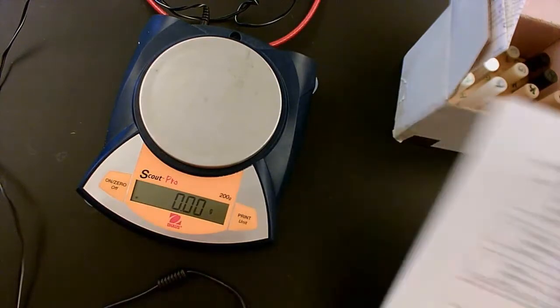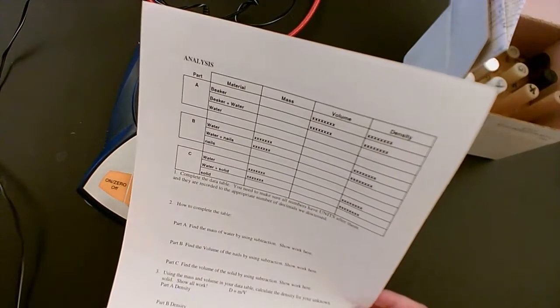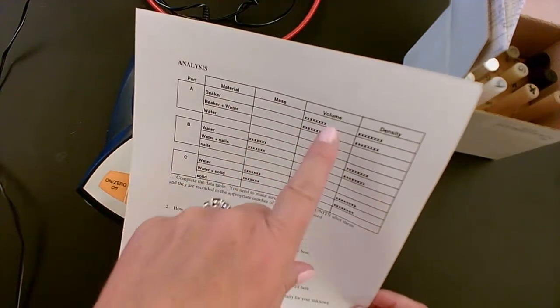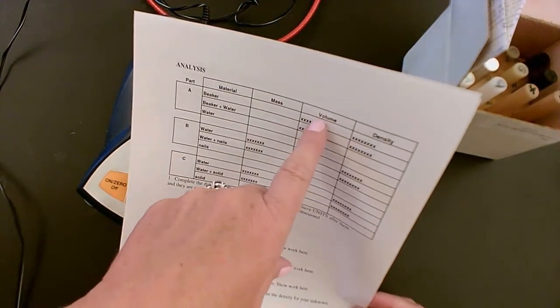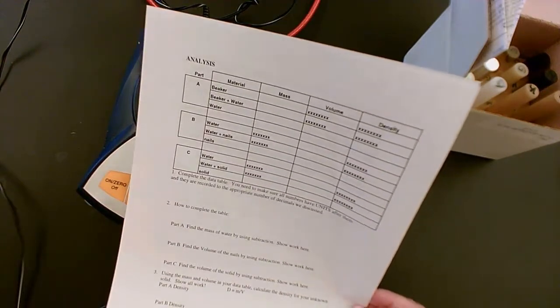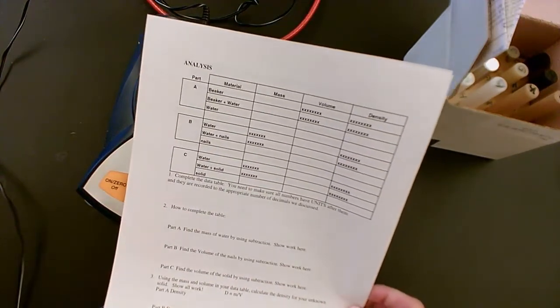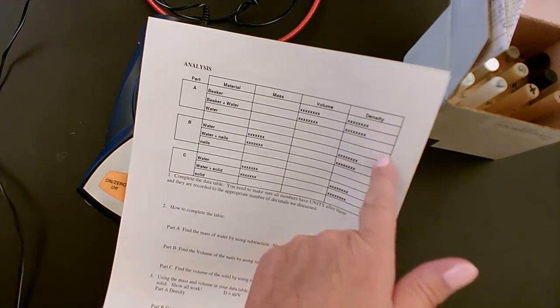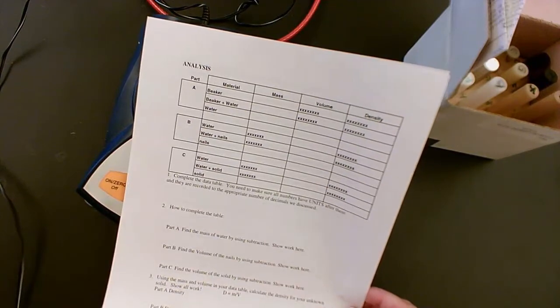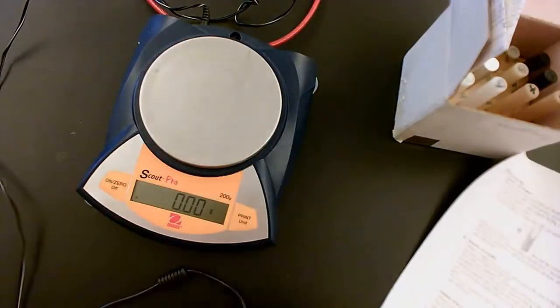And the second page is the data table, which you will need to fill out with units. Mass is in grams, volume is in milliliters. Once we get all the mass and volume data table parts filled in, then we'll take some time and calculate the density of water, the density of nails, and the density of an unknown solid. So going back to the procedure, the density of water.